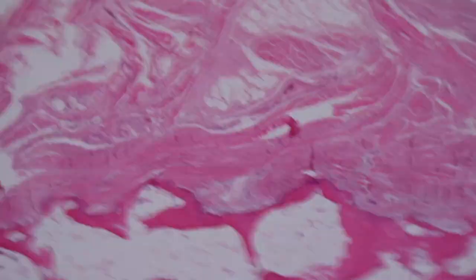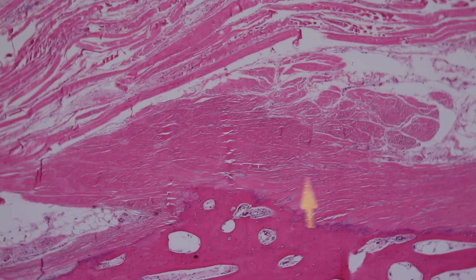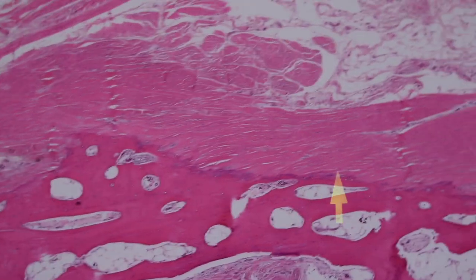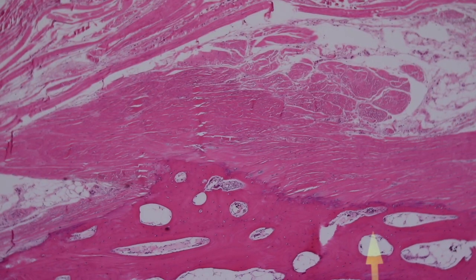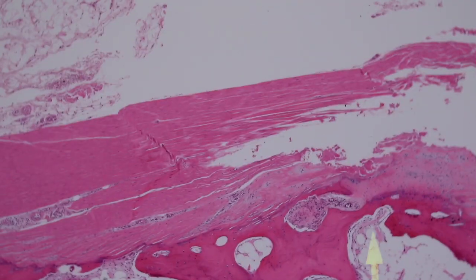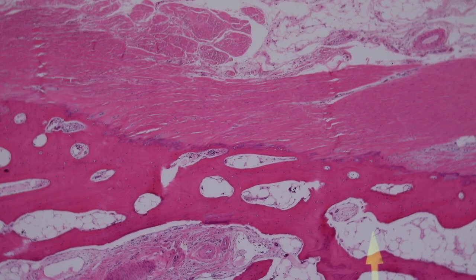Coming right off the bone here you can see this dense pink layer — dense regular connective tissue. I mentioned earlier that dense regular connective tissue is either fascia, tendon, or ligament. Here you can see this broad band connecting to the bone. If on the other side it hooks up to a muscle, then it would be a tendon; if it hooks up to a bone, it would be a ligament. Ligament, tendon, and fascia look very similar at high power — it's really the context that lets you tell them apart. This is probably a tendon connecting to one of the muscles that allows you to flex or extend your fingers.